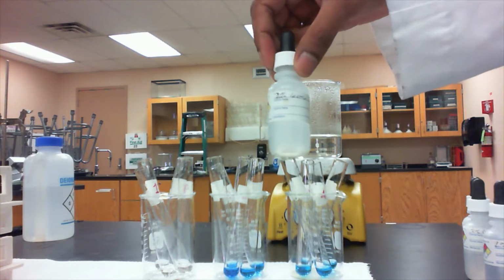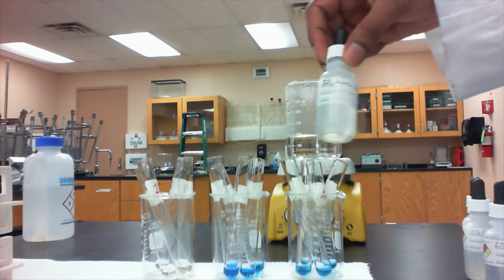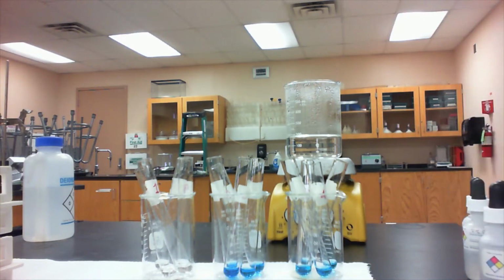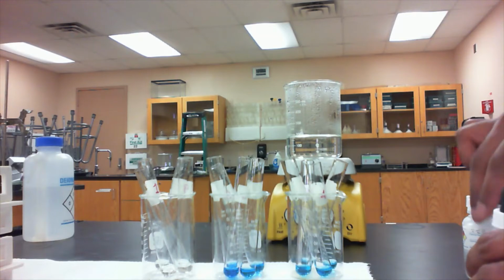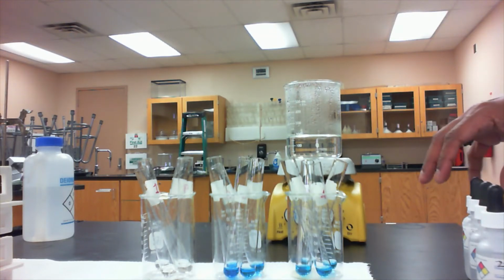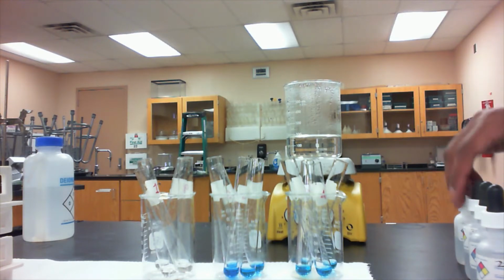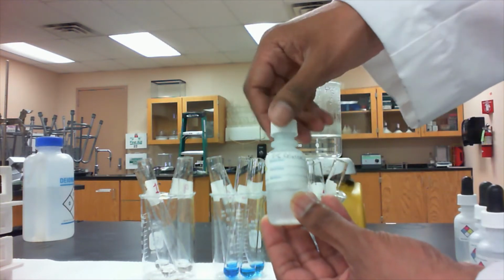All right, I know it may be difficult to see the names on these, but what you want to pay attention to is that all 4 of these sugar solutions are colorless. According to the system laid out in your procedure, I'm going to add, for example, 10 drops of the 2% glucose solution into test tubes 1, 5, and 9. So there's my 2% glucose.